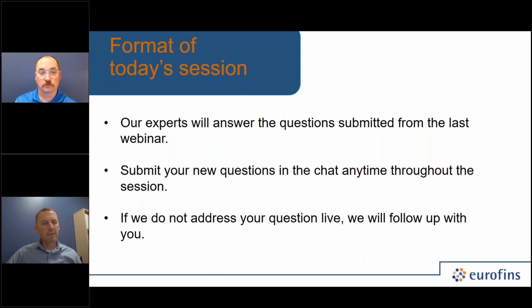Okay, since we're on the topic of postbiotics, let's stay there. Can you talk a little bit about the ability of flow cytometry to be used for enumeration of postbiotics, as well as what some of the challenges are in that particular area, since it is a growing field with increased interest lately?